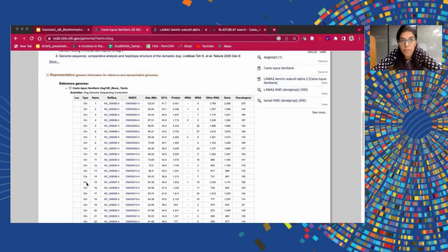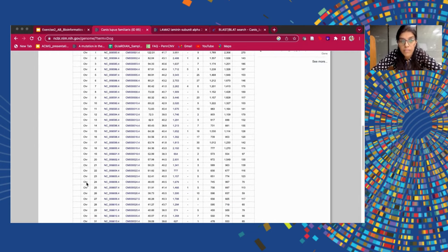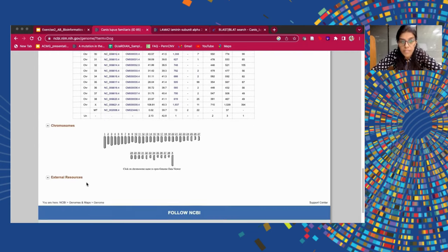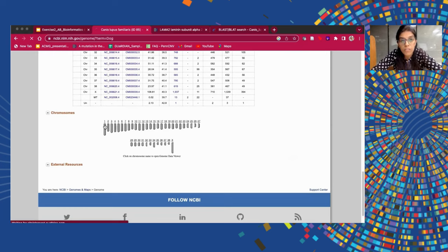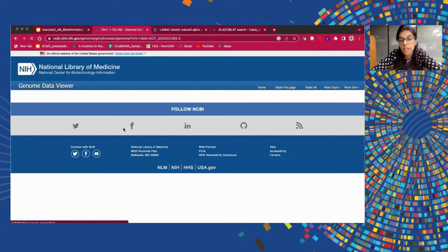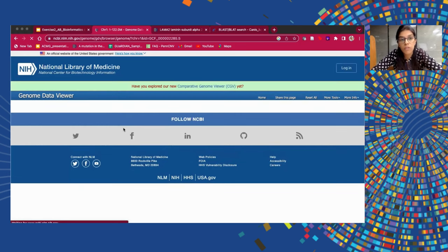If we scroll down below, there is a tab called chromosomes where you can see the number of chromosomes present in the dog. If we select a chromosome — for example, just for the sake of ease, I'm taking chromosome 1, though you could select any chromosome you wish to.